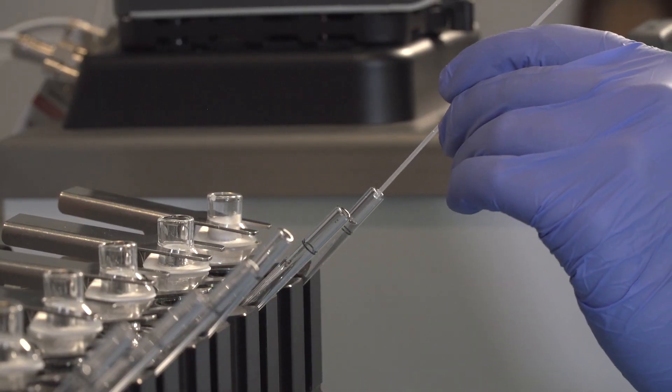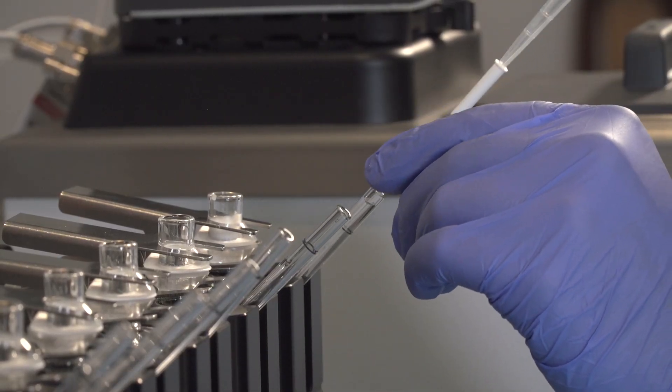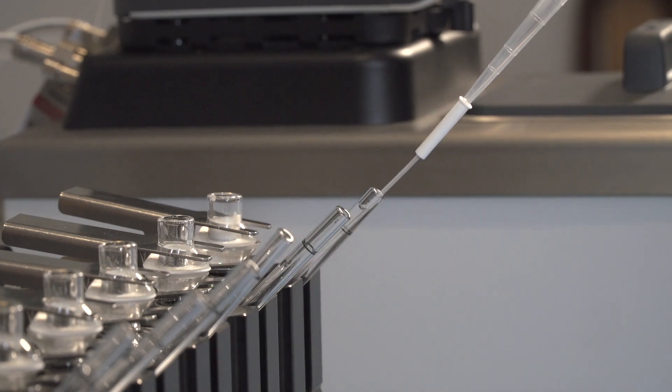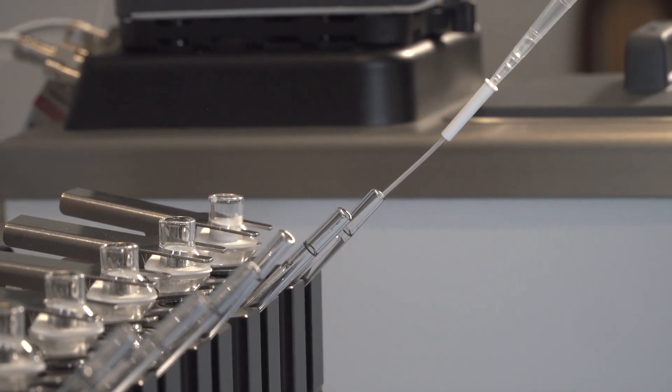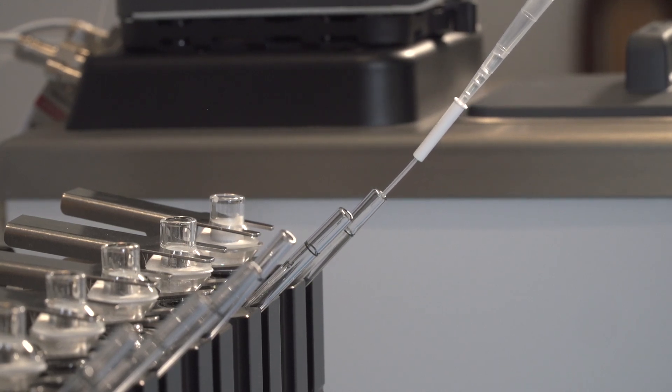To sample, depress the plunger of the pipetter to the first stop. Insert the PermeGear tip through the arm into the center of the cell and release the plunger. Wait three seconds to allow the receptor fluid to stop flowing for an accurate volume.